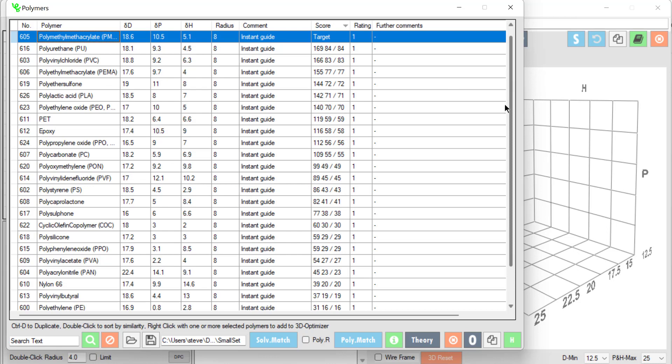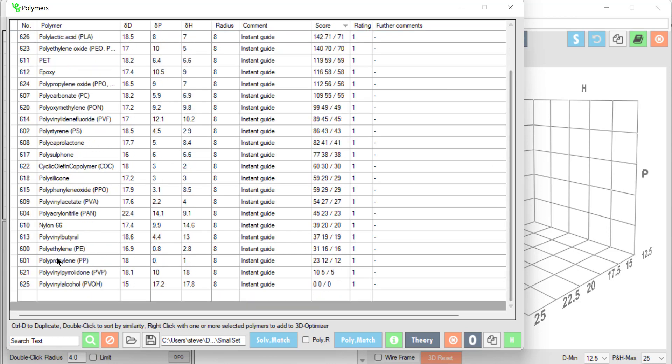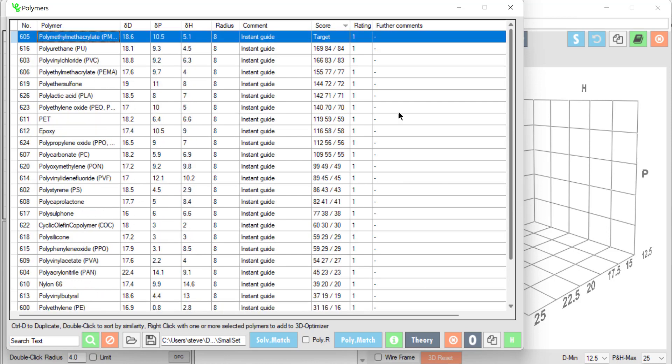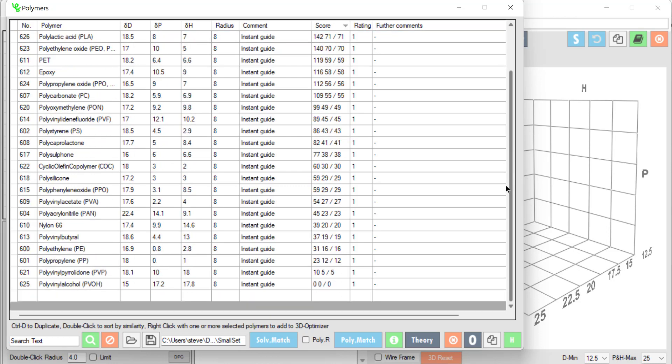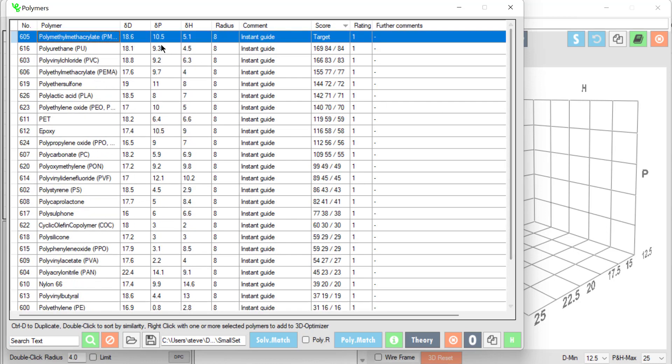And if I go to the bottom I find that polyvinyl alcohol is very far away because it has a very high DH. So that's very different from this DH. And I also find that polypropylene has a very different DP and DH from our DP and DH. So we have them sorted by distance. So we can find compatibilities between polymers.